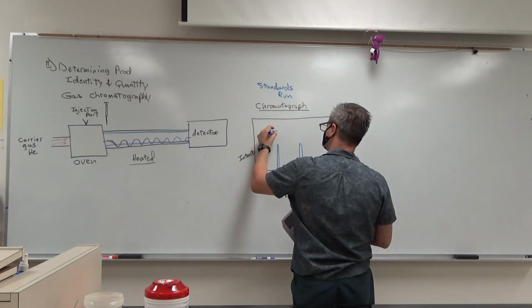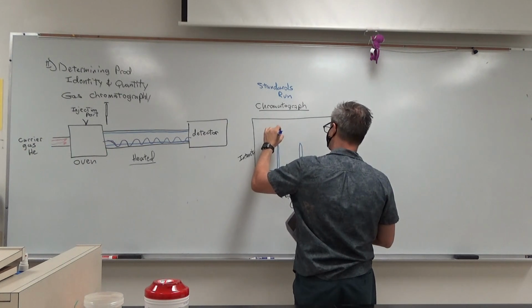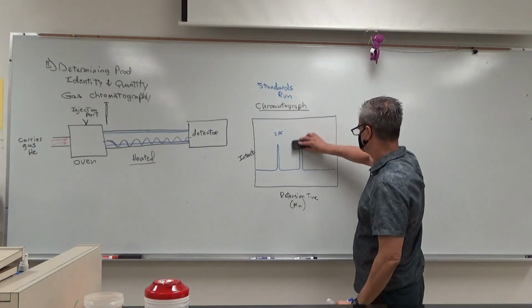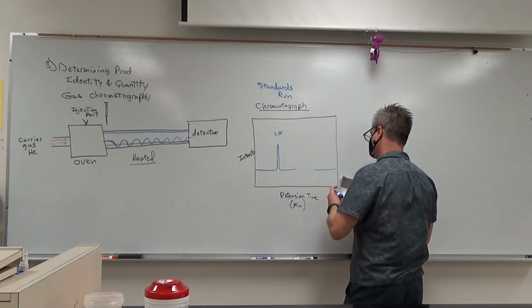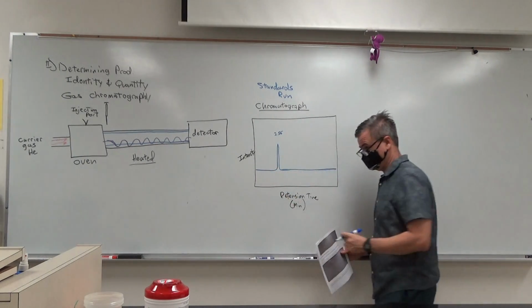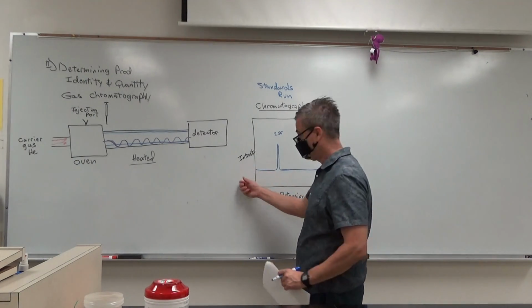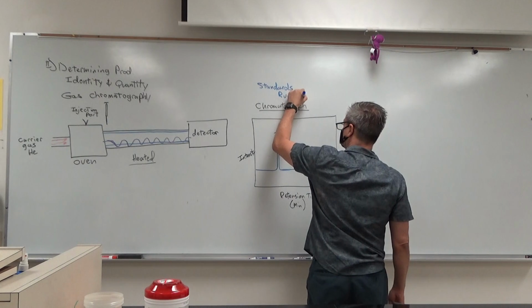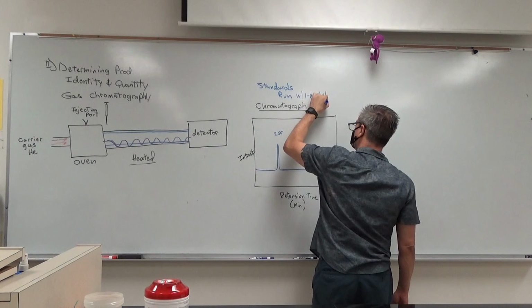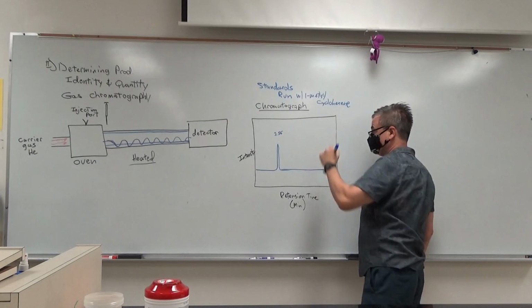Let's say this is minute 2.56, all right? Yeah, shucks. I'm so sorry. That's a weird way to run your standards. You should run your standards one at a time. Okay? So we know what we put in here. Standard runs with 1-methylcyclohexene. That's what's going to happen.